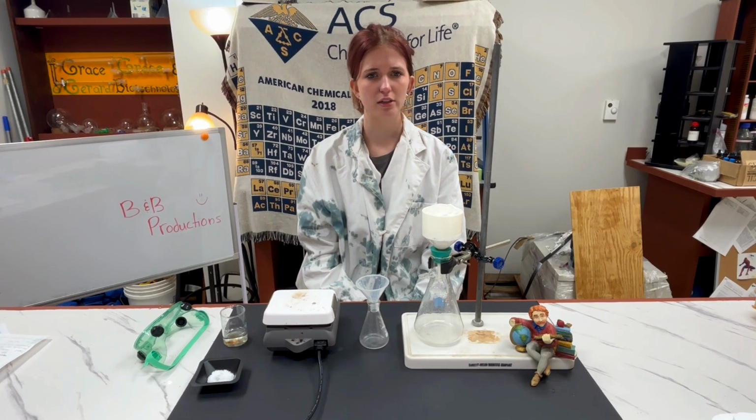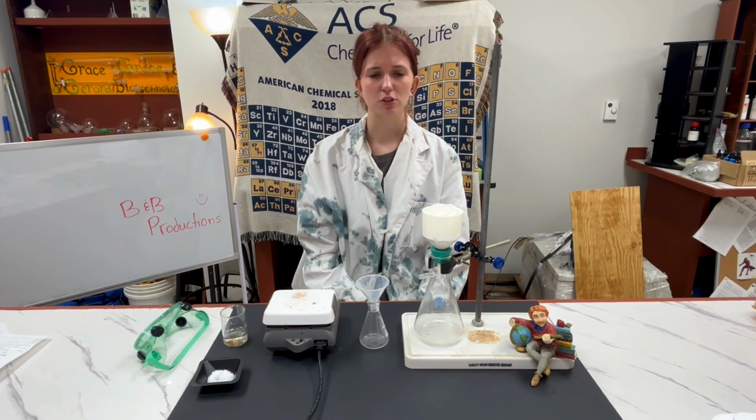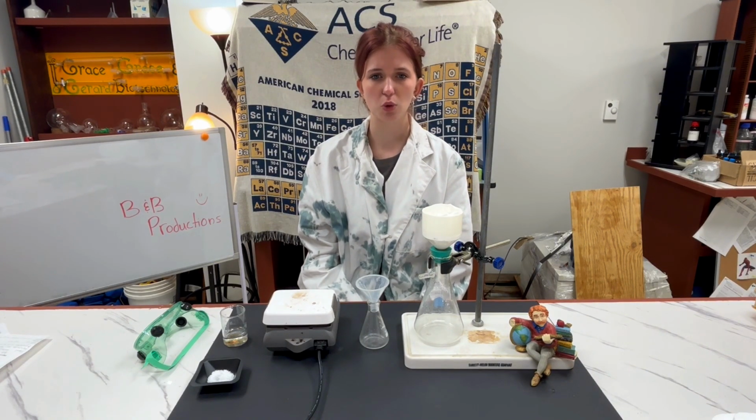The solid is usually dissolved in the hot solvent until the solution becomes saturated. The solution is allowed to cool at room temperature and then furthermore by ice. Allowing the solution to slowly cool allows for the formation of larger crystals.